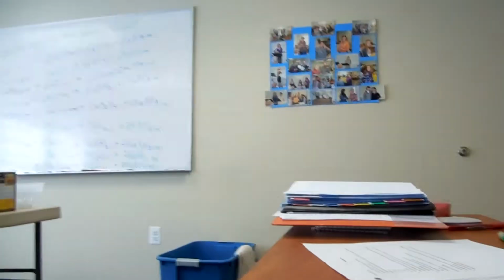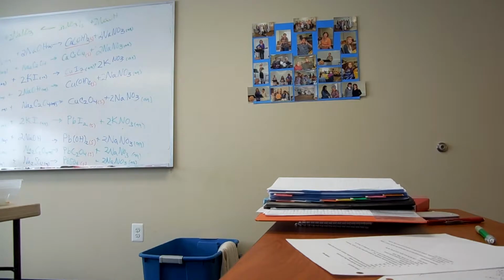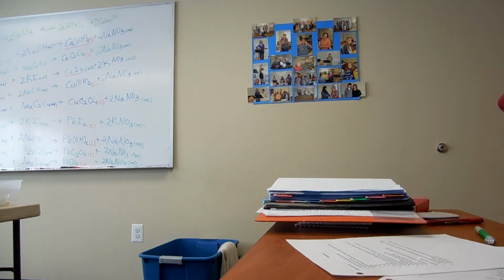So Austin's going to wash his hands. Liam and I are going to use the black. Do you think that's cloudy or not cloudy? This one? It's not really cloudy. It's a little cloudy. Well, it says the 6 wells that did not have a reaction. We had all of them that did have a reaction. Let's put it right next to just clear. When you put it next to clear, you can see that it's cloudy.